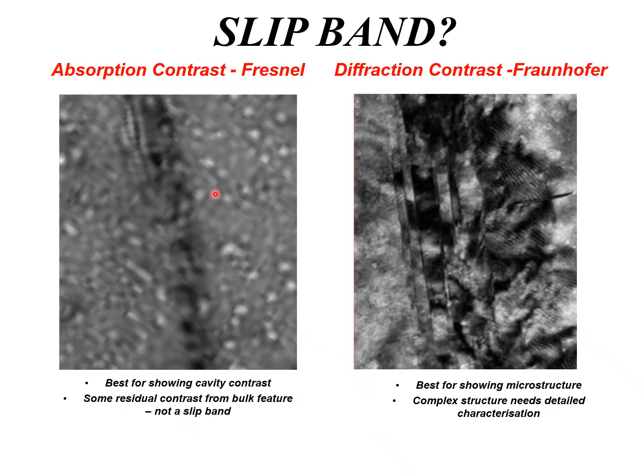So here's the image in a little bit more detail, so you can see where this cluster of platelets is. Now, I don't know what they are. They could be twins, could be martensite, but they're sheared, because there's no chemistry related to that. That touches on another thing that's come up more recently. Somebody said to me, how do you know you've got martensite? And I said, well, because it's hexagonal and lots of people report martensite.